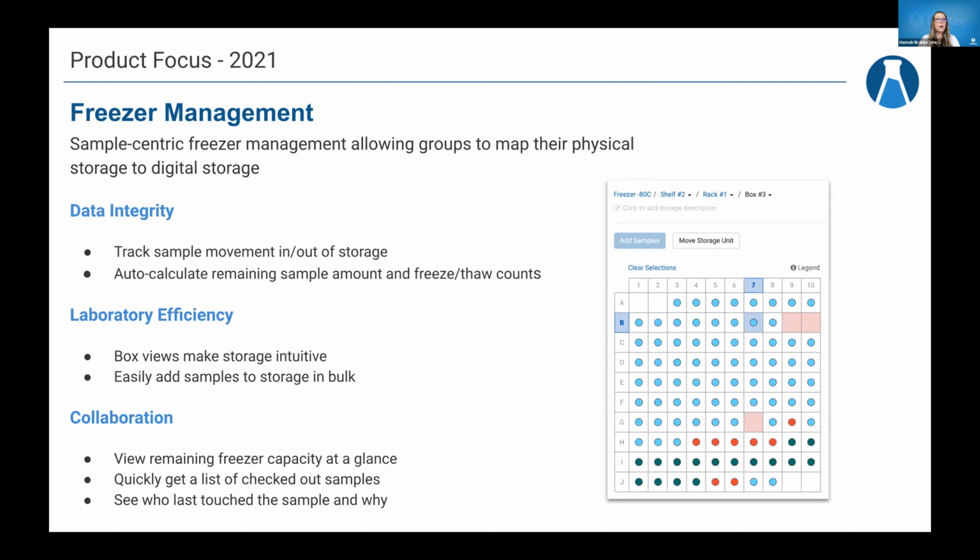And so going off the three themes that we have, you can track that sample movement in and out of storage, check in, check out events as it's moving between storage units as well, where we'll track all of that. We auto calculate the remaining sample amount.